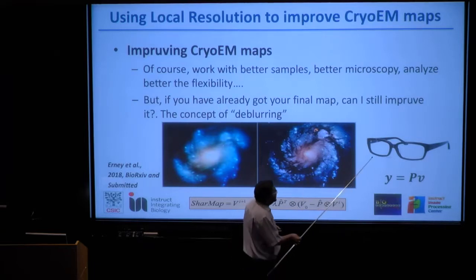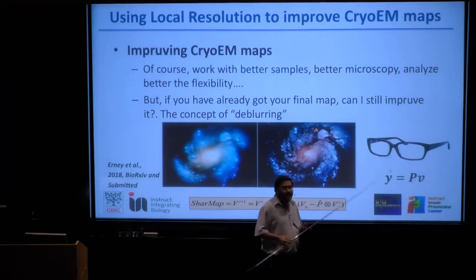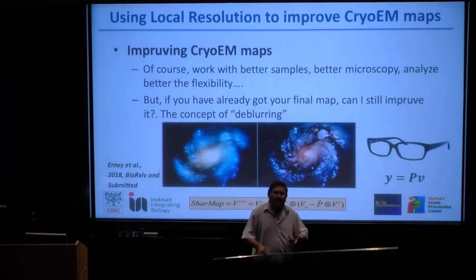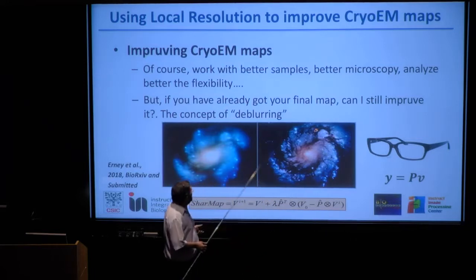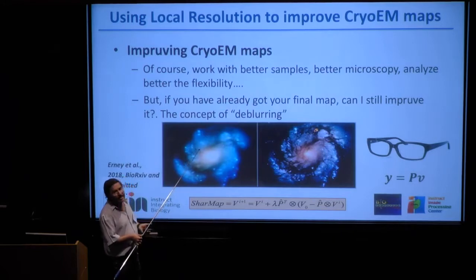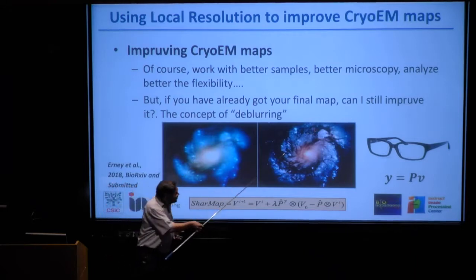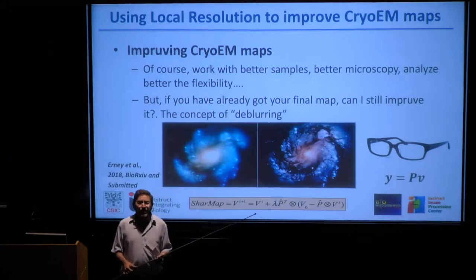Well, the idea is that virtually any system is going to introduce errors, and you have a perfect image, and this perfect image is going to appear quite imperfect depending on the errors that the instrument introduced. This is the case of the Hubble instrument, and through a deblurring process they got normally quite good images.